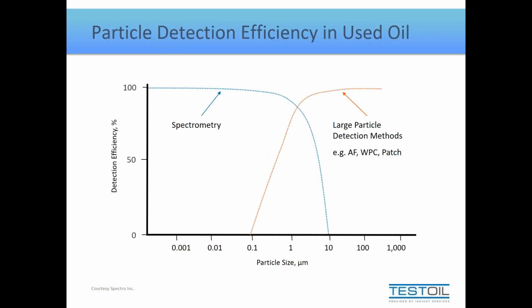When we are concerned that there may be larger particles present in the oil than are being detected by spectroscopy, definitely analytical ferrography will give us a broad spectrum of all the larger particles, be they wear metals, contaminants. Wear particle concentration, on the other hand, is just ferromagnetic particles. So it obviously focuses on ferrous, iron type parts, and it can provide no information on anything else.